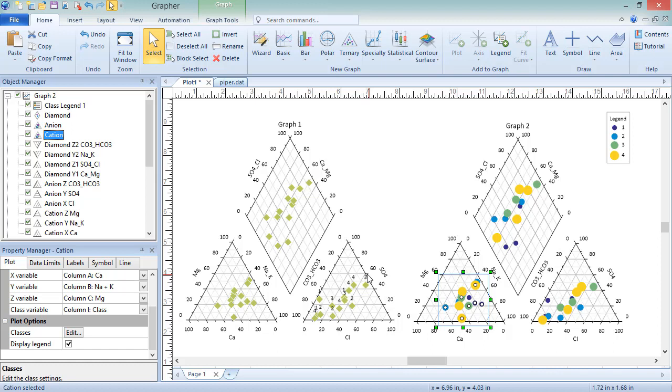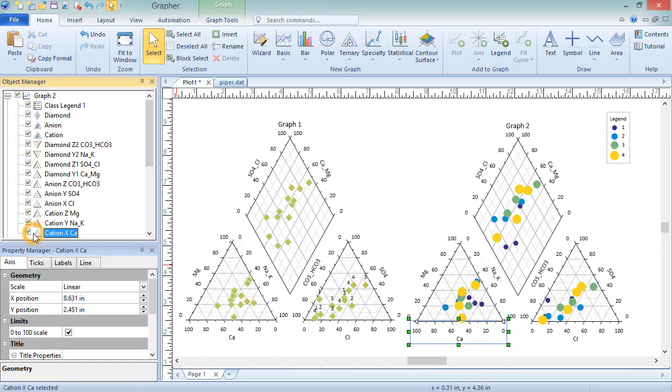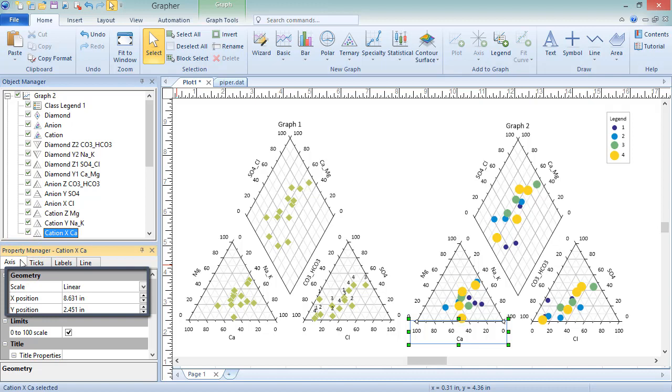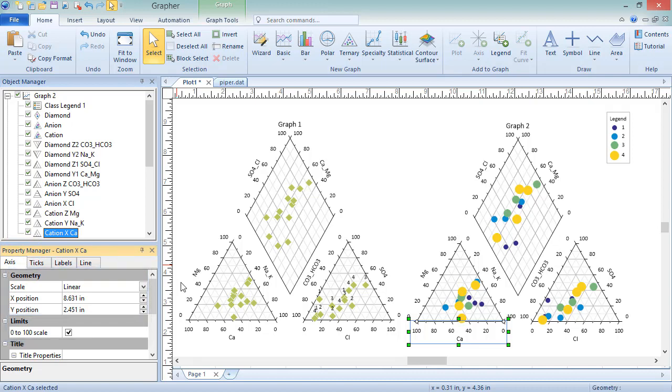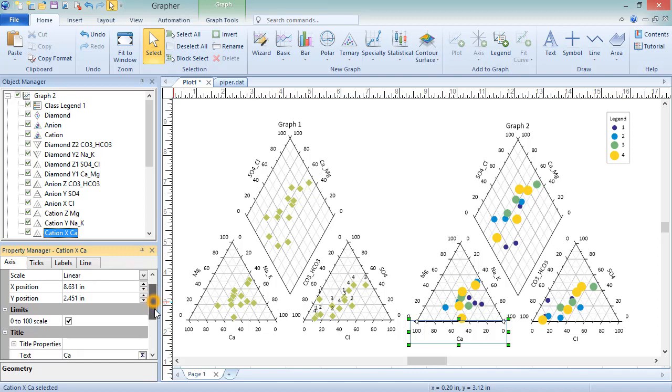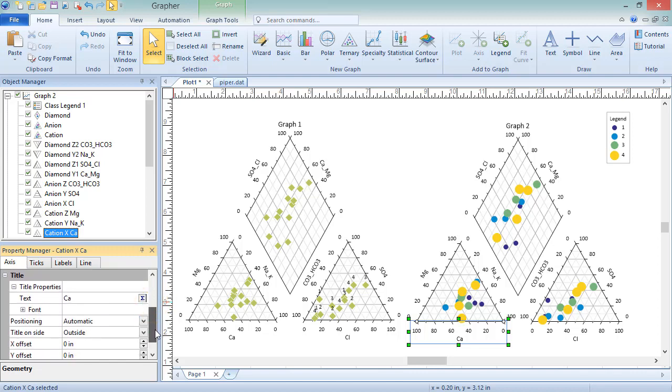Piper plot axes can also be edited by adjusting the properties in the Property Manager. All Piper plot axes, whether corresponding to a ternary or diamond, classed or unclassed plot, have the same properties. On the Axis page are Scale and Position properties, the ability to display labels on a 0 to 100 scale rather than a 0 to 1 scale, and Title properties.